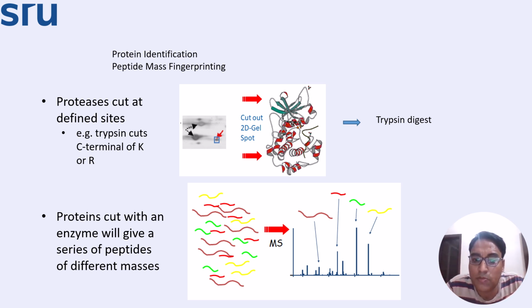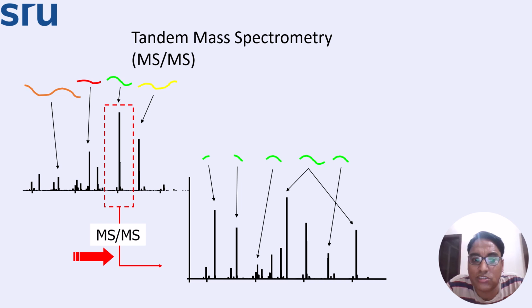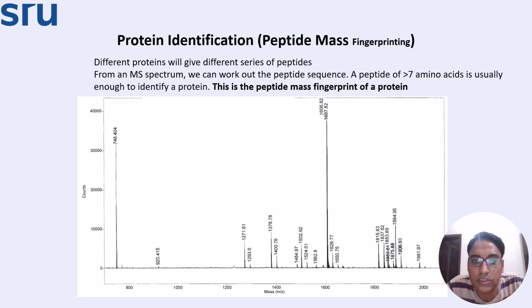You see, for these seconds I'm getting a result like this. This is more detail you can see here. If this is the part, I can zoom it further. See this one in more detail. This is termed as peptide mass fingerprinting, PMF.